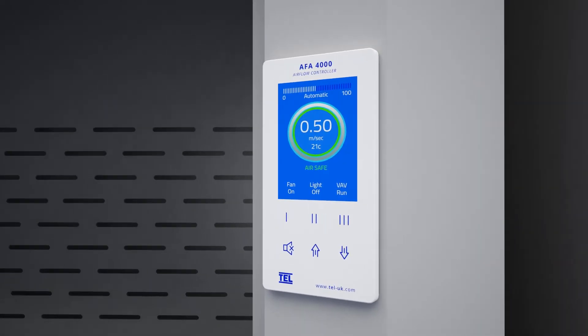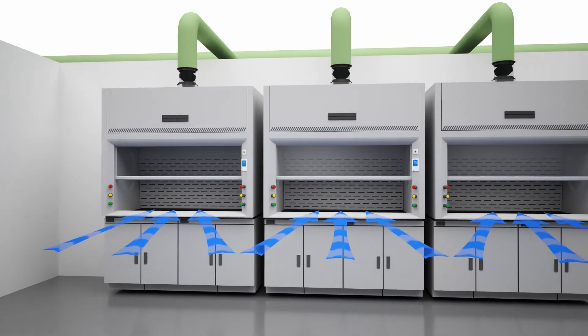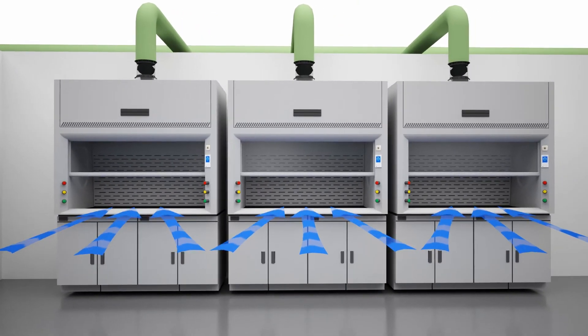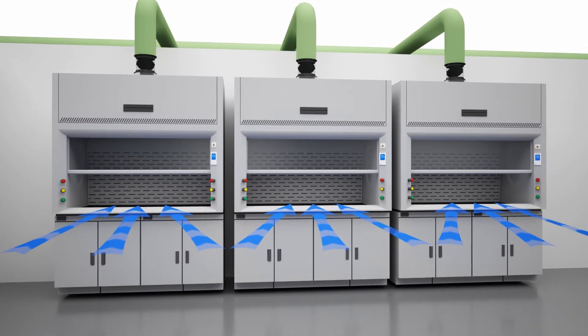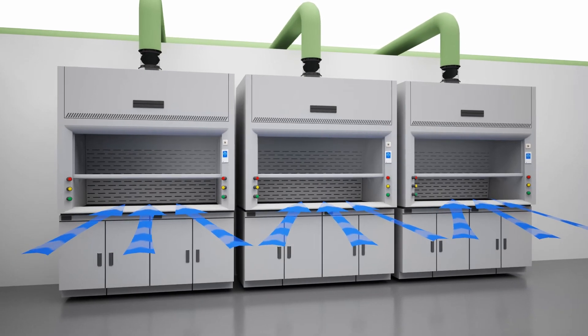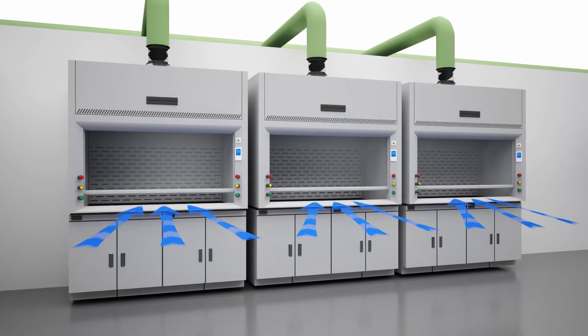Our Auto Sash Controller for Fume Hoods maximizes energy savings and provides increased safety for operators by closing the sash automatically when the operator isn't present in front of the fume hood.